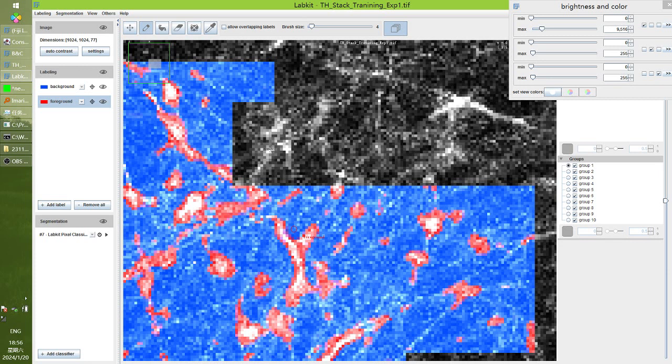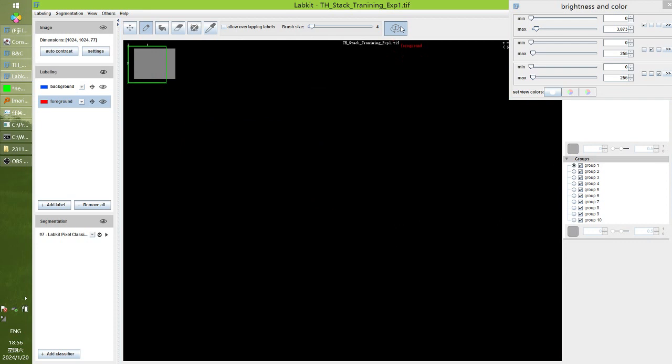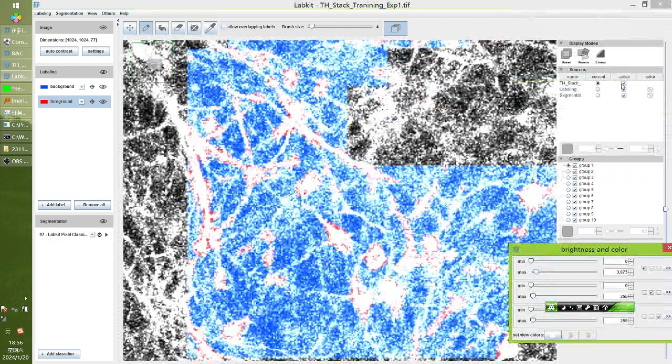Okay, we look at it here, it starts to process. So anywhere we look at it, it is lazy processing. It's called... Okay, where is the image? Cannot find it. Okay. Lazy processing.